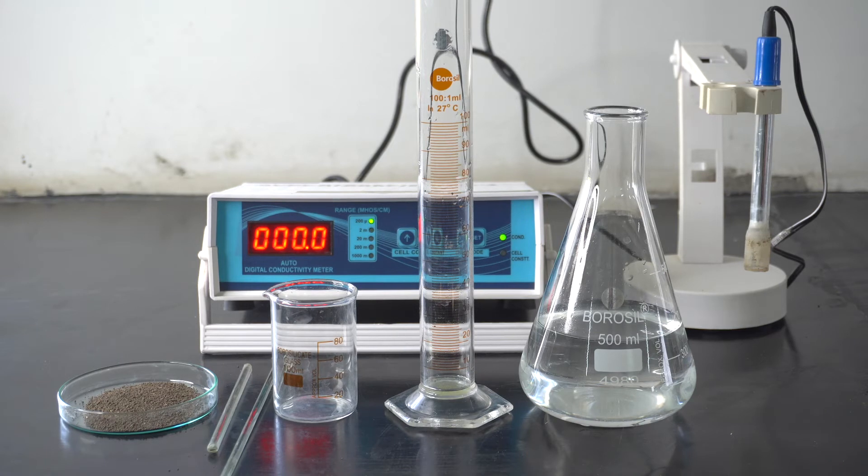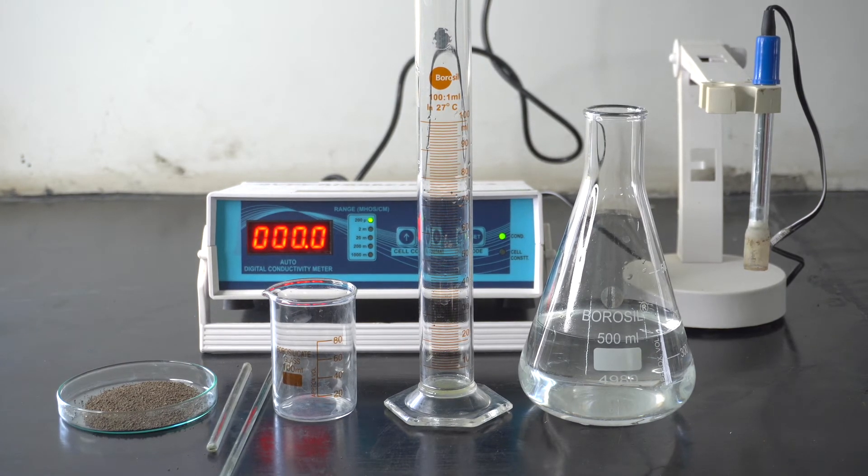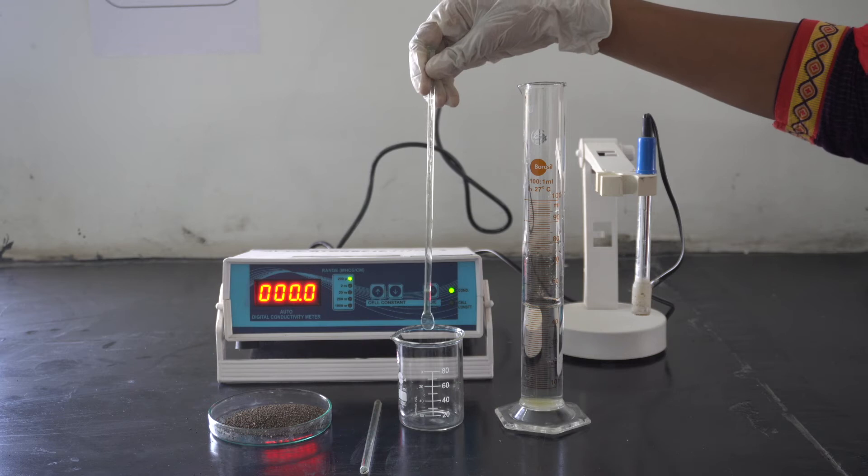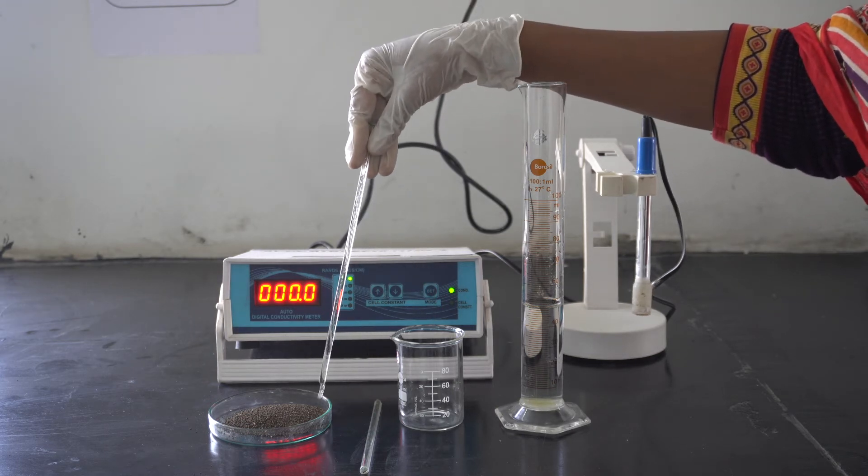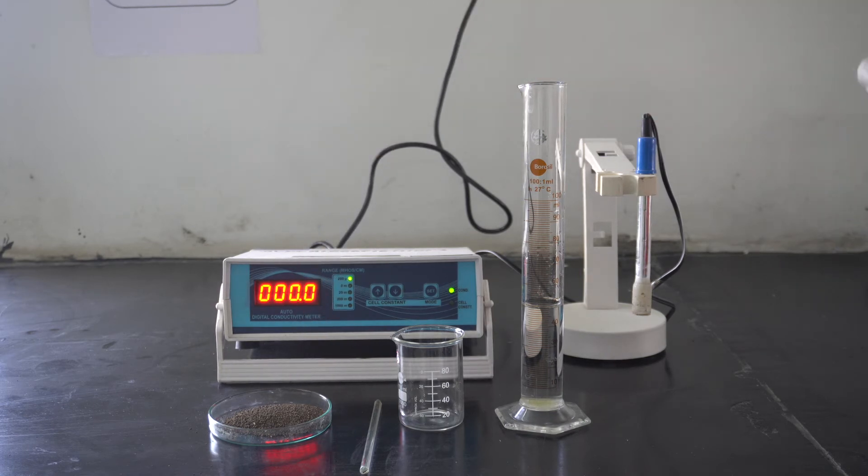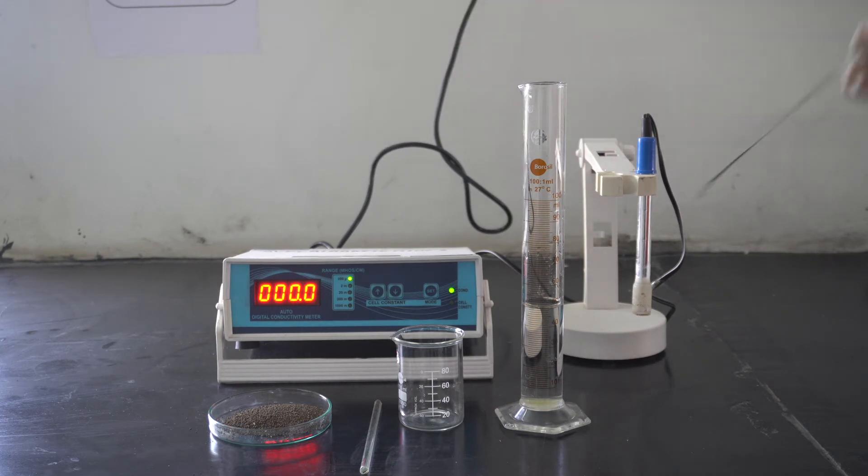Let's get to know more about how to measure electrical conductivity of soil sample. First, we will require measuring cylinder, beaker, glass rod, 20g of soil sample, electrical conductivity meter, and electrode.